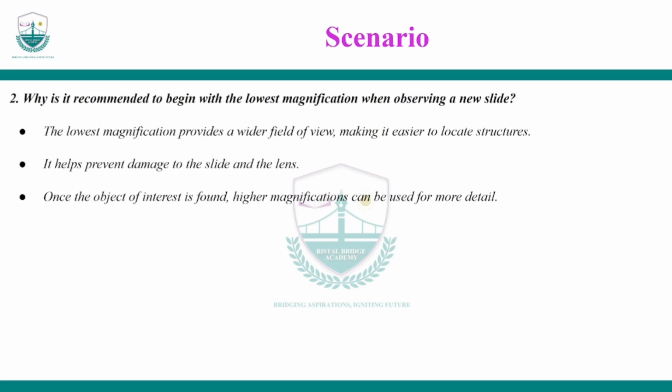But also, using a lower magnification prevents damage to the slide and also the lens. So start with low magnification, then move to higher magnifications.